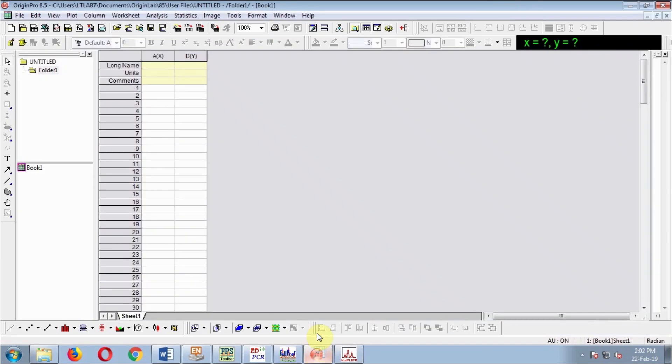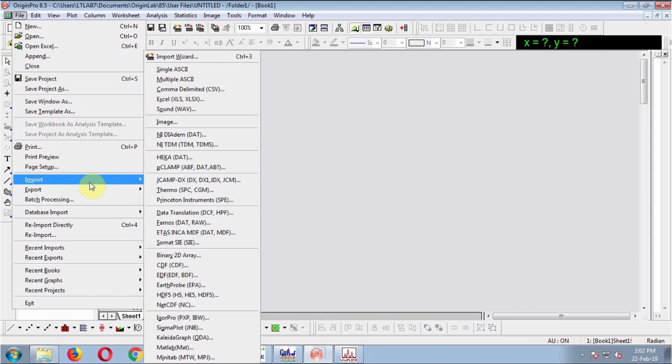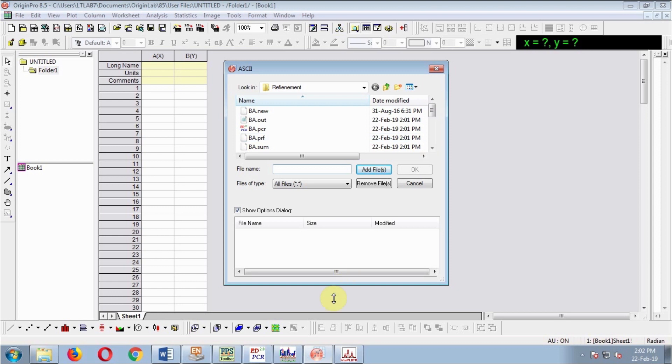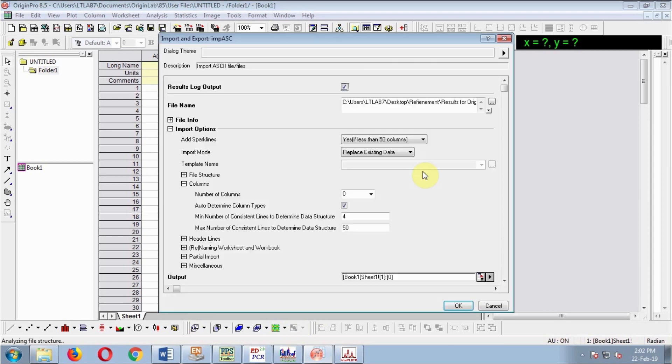Open Origin. Go to File, Import, choose Multiple ASCII. Select the file 'results for origin,' then add file. OK.